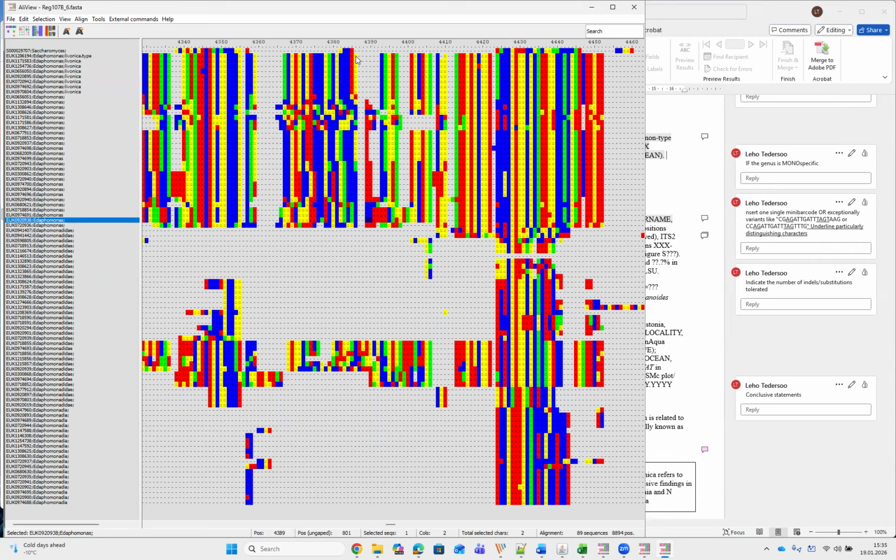When we check the length of this, right, it's exactly 20 nucleotides, so it's well suited for our purpose. If it's too short, we could add extra material from either right or left, however we feel appropriate.